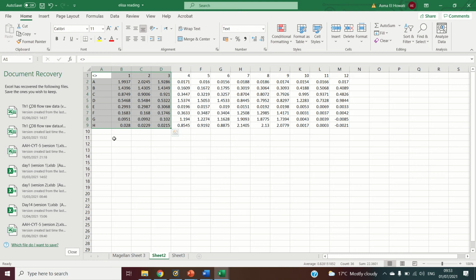To start with, it depends on how you measured your absorbance values with the plate reader, but in some settings, the machine will automatically subtract the background values. Sometimes it doesn't.